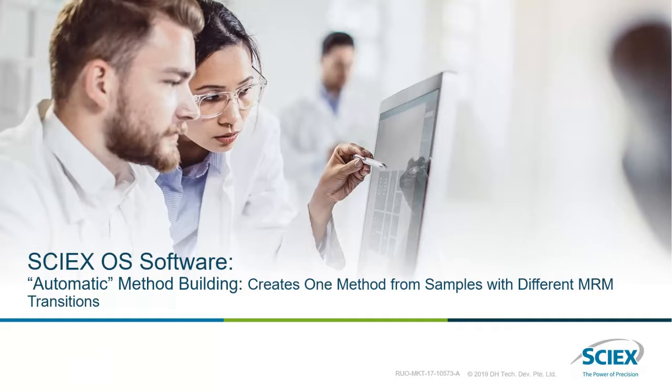This is part of a set of short videos on getting the best from SciXOS software. In this video we are going to explore the automatic method building function that can create one method for samples with different MRM transitions.